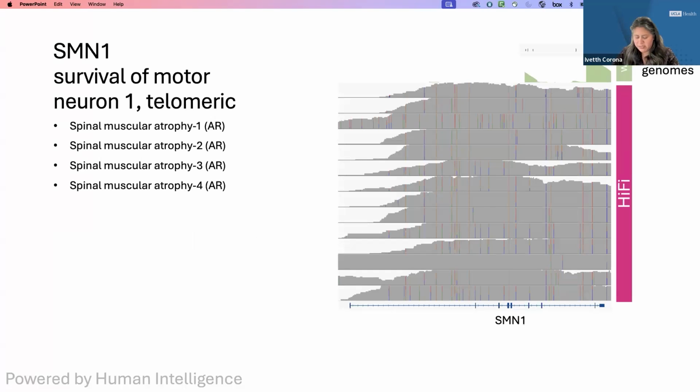So I think it was last week that a group from the UDN UCLA clinical site was telling me about a lot of genes that are problematic and hard to resolve using short read. I have a list of maybe around 10 genes, and there could be more. I'm going to show just two, because it's very clear. So you have SMN1, which is the gene that I'm showing here at the bottom. So this is the 5' and this is the 3' end.